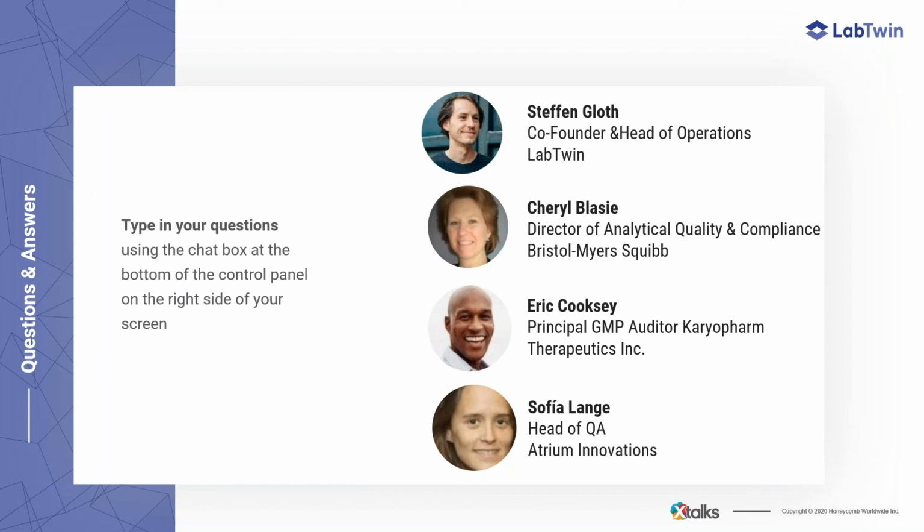Starting with our first question, very open-ended to anyone who wants to jump in: what type of risk assessment is involved when transferring manual, written data to an electronic system in a GMP environment? If anyone could elaborate on that risk assessment process.